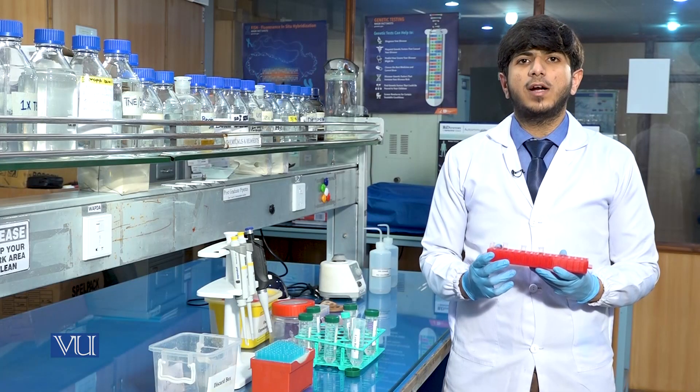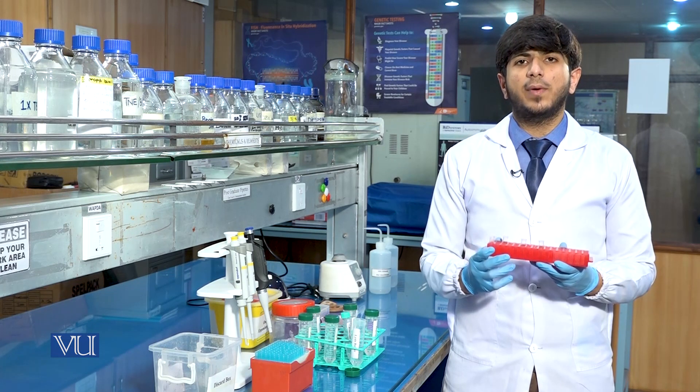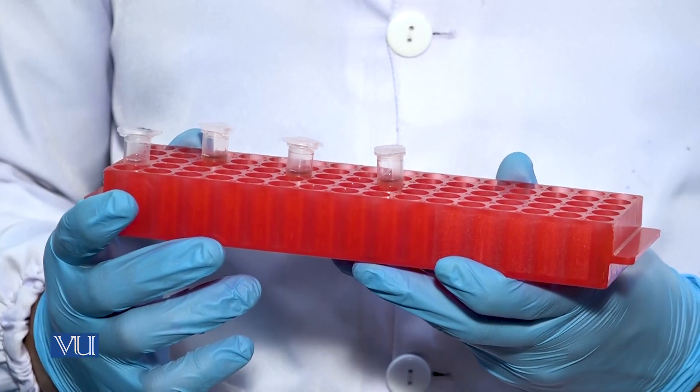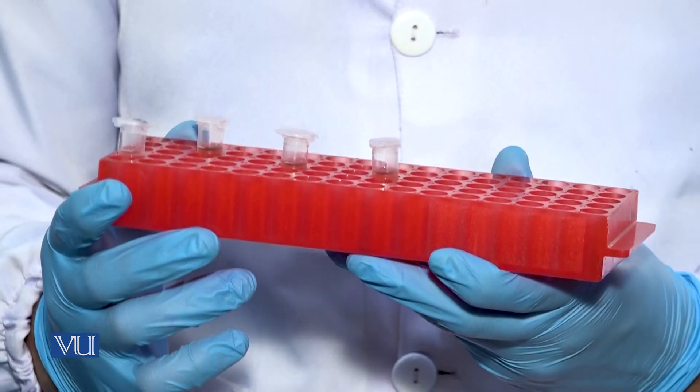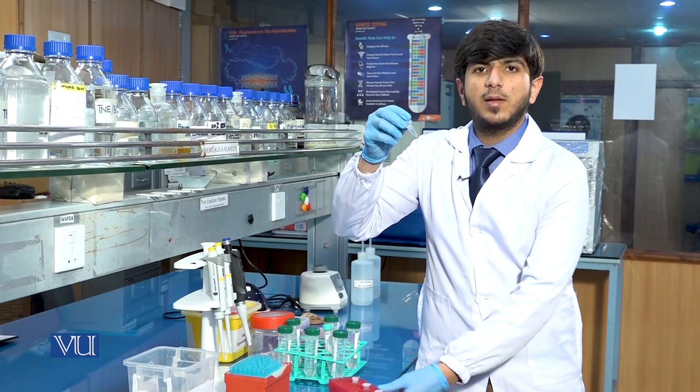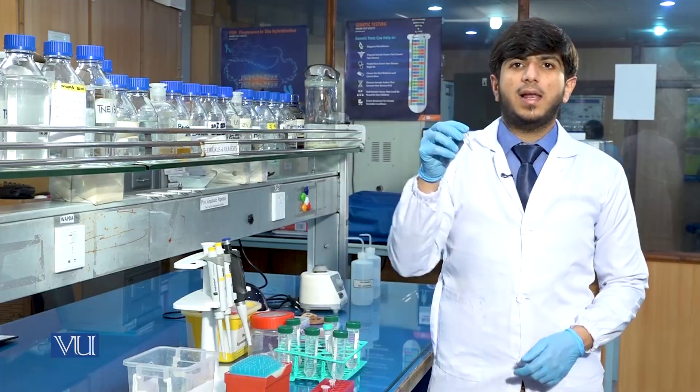Now again for the third washing, we will centrifuge the sample on the same conditions as previous: 13,000 RPM speed at 4 degrees Celsius for 15 minutes. After the third washing, the results will be like this — the pellet will become colorless.